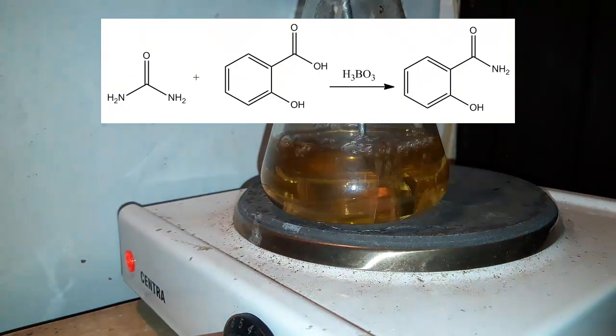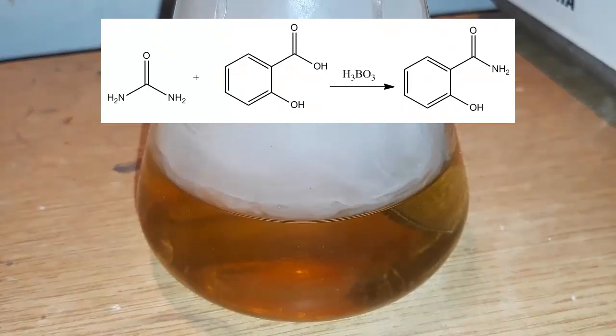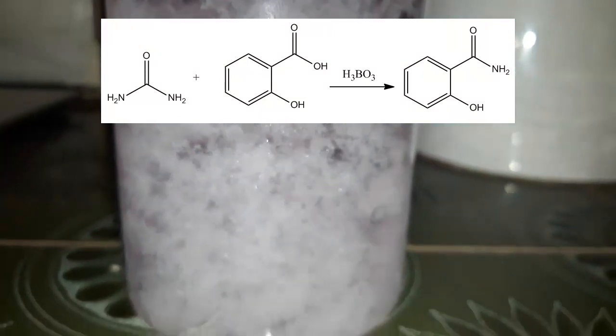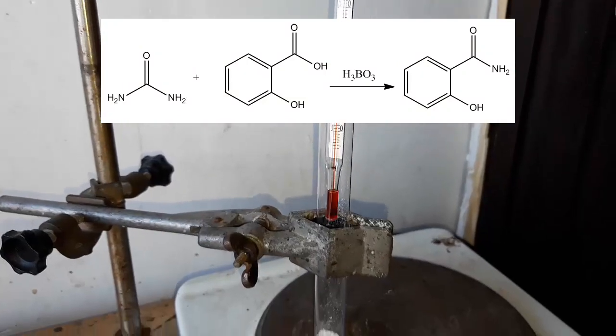Hello guys and welcome to the first episode of our salicylic acid saga. Today we'll be making salicylamide from salicylic acid and urea. This is the first time I tried this reaction, so it will be an experience for us both.